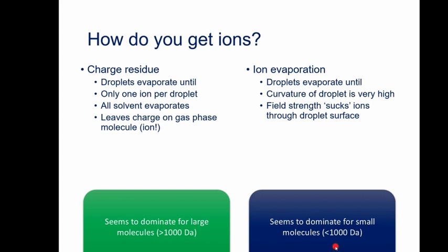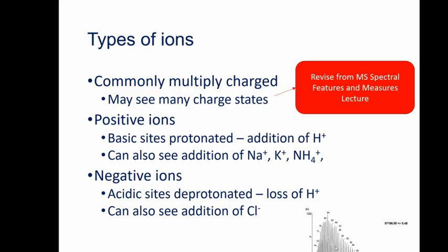In practice, of course, does it matter at all? And honestly, I don't think it does. From the point of view of the user, does it matter which one of these models is making your ions, as long as it makes ions? I don't think it does. You can get bogged down too much in the detail where it doesn't necessarily improve the quality of the application. And this, I think, is one of those cases.